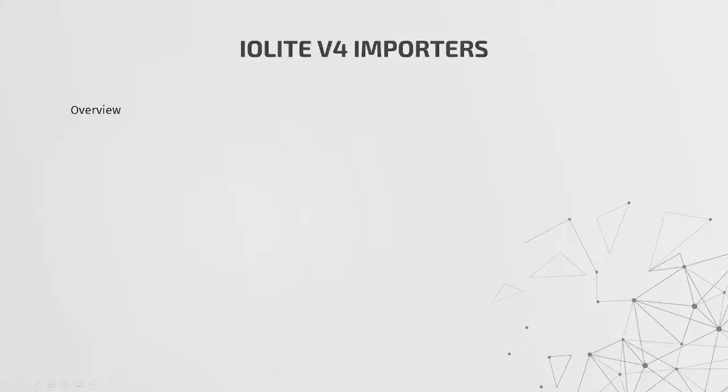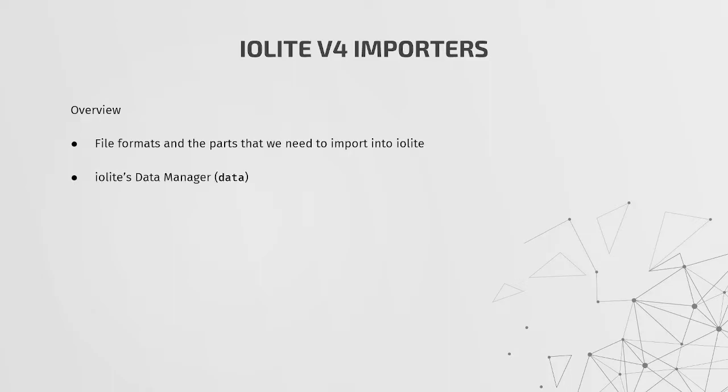Just to give you an overview, in this presentation we'll be looking at file formats and the parts that we need to be able to import our data into Iolite. We'll have a quick look at Iolite's data manager because that does a lot of the work that we'll be doing in our importer. We'll have a quick look at channel, file and sample objects. And we'll be looking at an overview of Iolite's import process so that we know where our importer fits into that process.